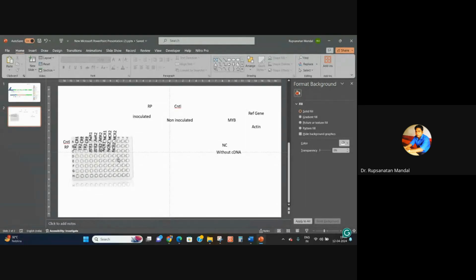Or when you are preparing the PCR master mix, sometimes we are talking without wearing any masks, so some microorganisms from our mouth may contaminate your PCR samples. So that's why we always put a negative control.